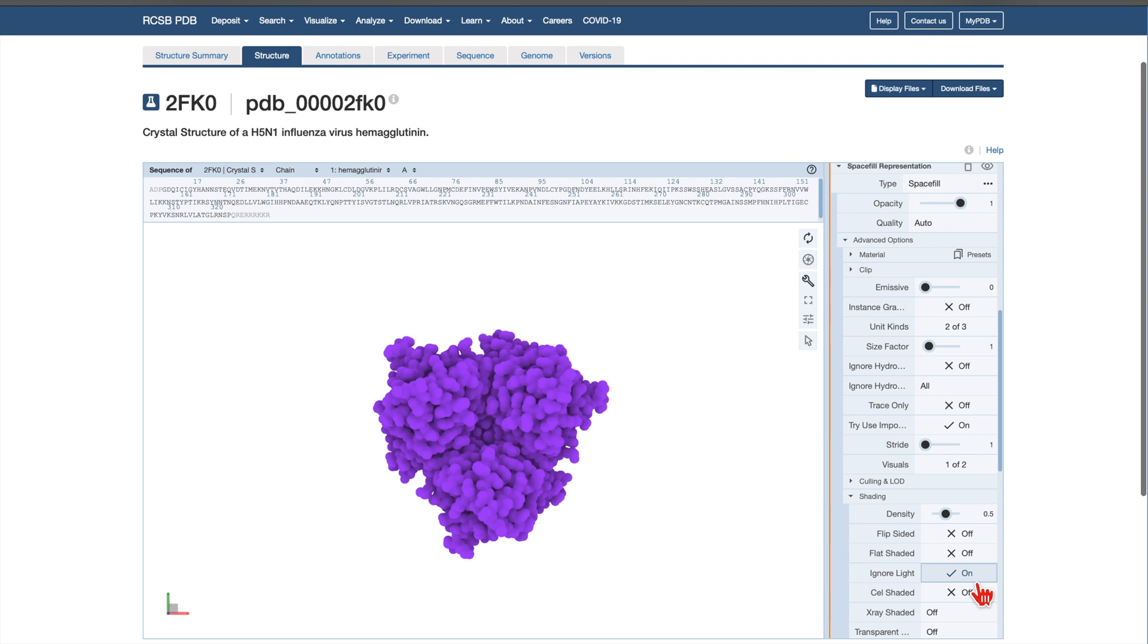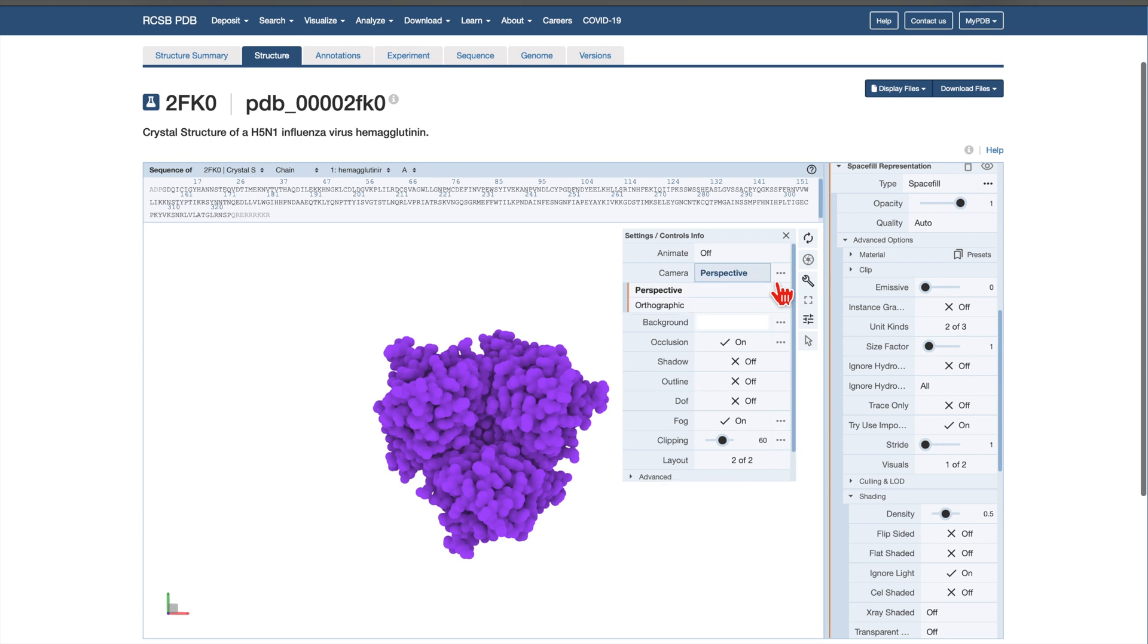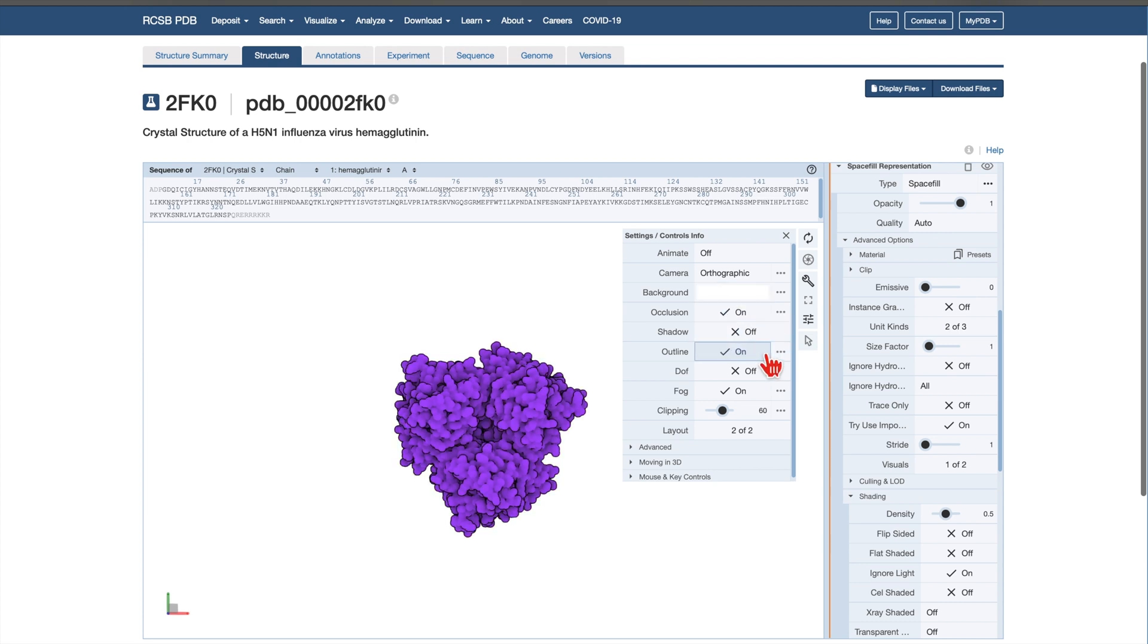Now, we'll adjust the projection mode and add outlines for clarity. On the right-hand side of the 3D canvas, click on the Settings Control button. In the pop-up, change the camera from perspective to orthographic to eliminate distortion and keep atom sizes consistent. Then, toggle outlines to On. This adds a dark contour around each atom, enhancing the illustrative effect.